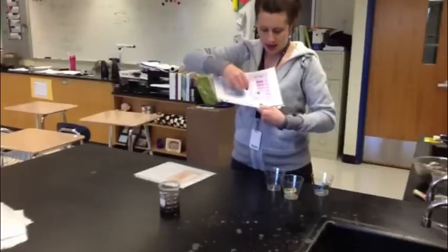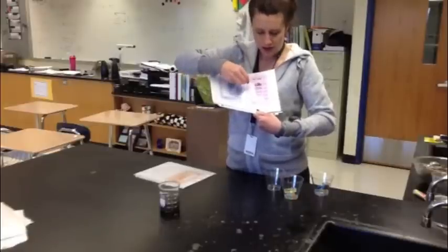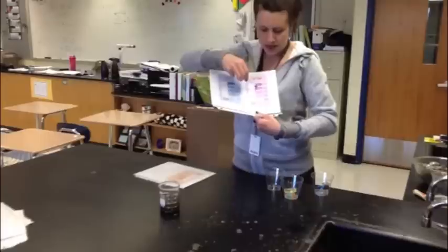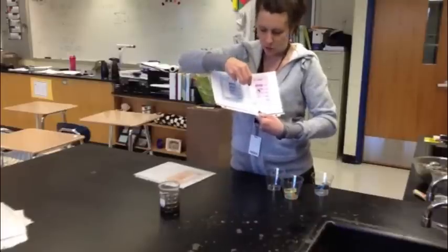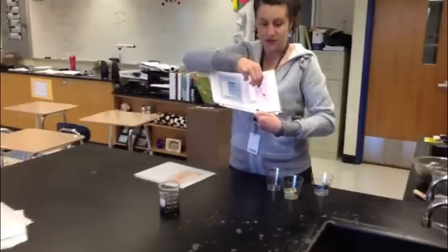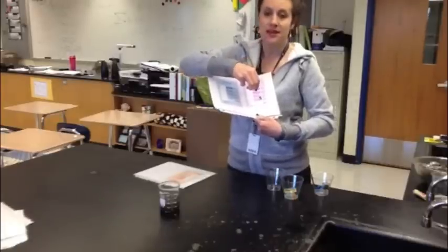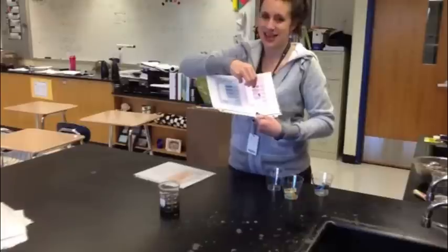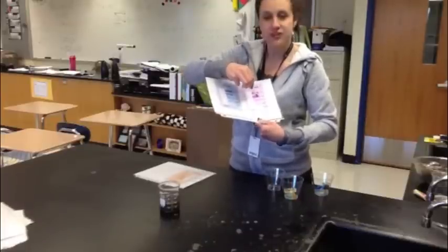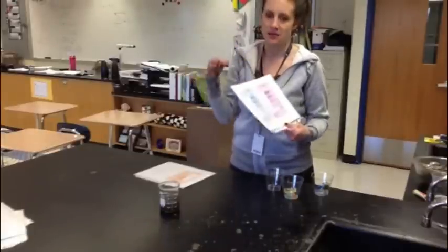You're really looking for the shade — how dark it is. You're going to have to make a determination and decide which one you think it most closely matches. Then once you have your decision, you're going to pick whether you think it's level 0, level 1, level 2, level 3, or level 4. That tells you whether the soil is depleted, meaning there is nothing in it; deficient, meaning it has a little but not very much; adequate, meaning it has a decent amount; sufficient, meaning it has a very good amount; or a surplus, meaning it has a lot of that substance.